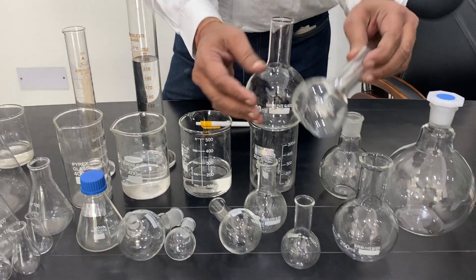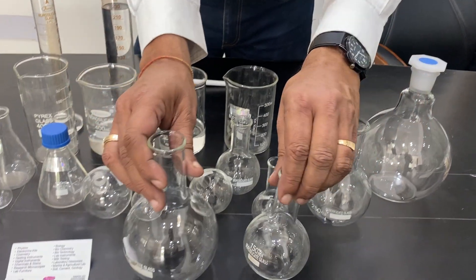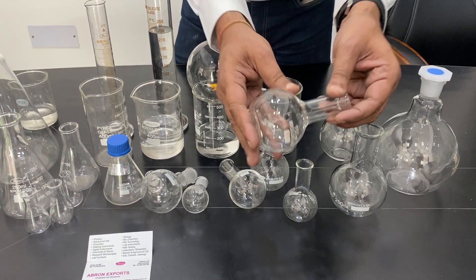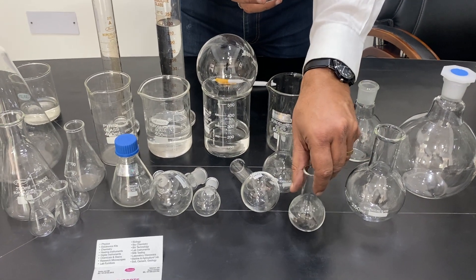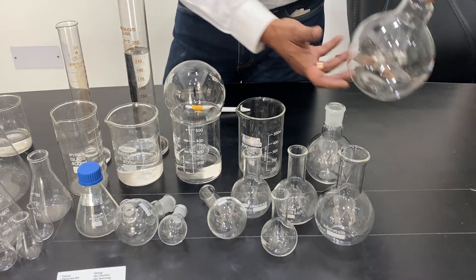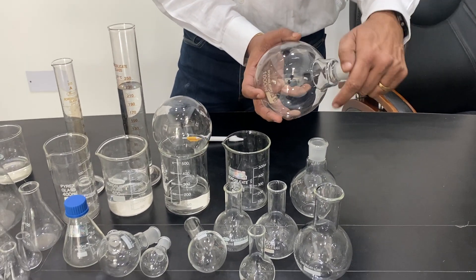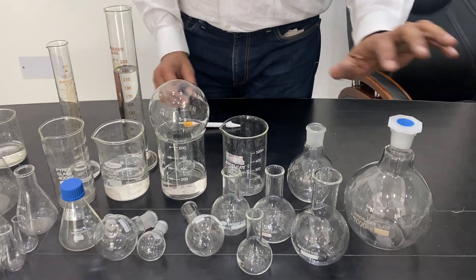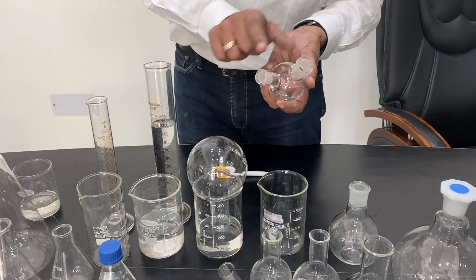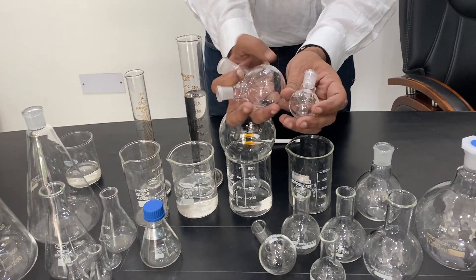Next comes the flat bottom flask. It has a flat surface so it can stand on its own — that is the key difference from the round bottom flask. It comes in different sizes: 25 ml, 50 ml, 100 ml, 500 ml, 1000 ml, and bigger. They also come with a quick-fit mouth for glass or plastic stoppers. The round bottom flask also comes in single, two-mouth, and three-mouth configurations at various angles.